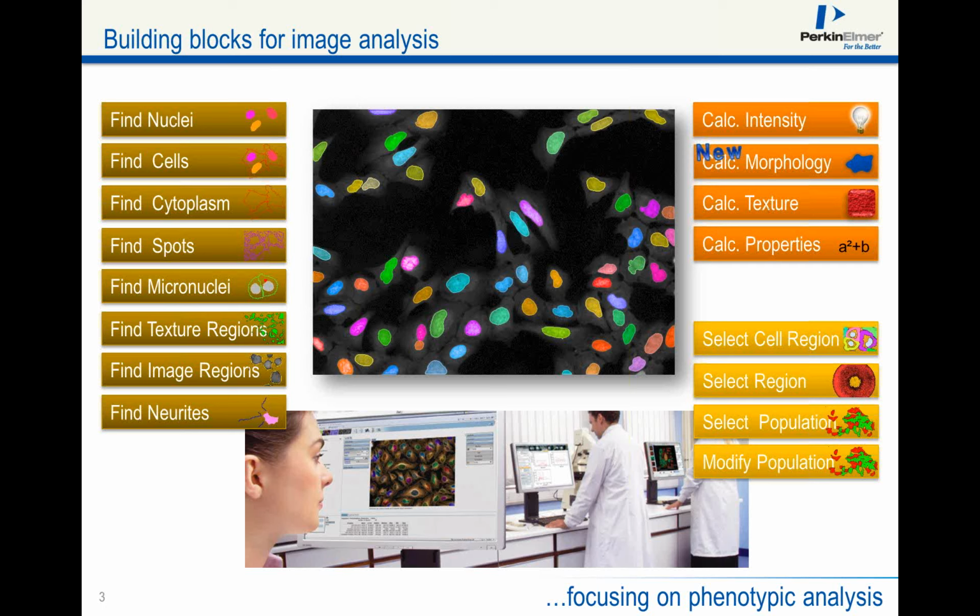As we know, screening and drug discovery has been focusing more on phenotypic assays and phenotypic drug discoveries. So Dr. Pegoraro and Dr. Kota will be speaking about how they're using our morphology and our texture analysis tools to get more information out of their images.